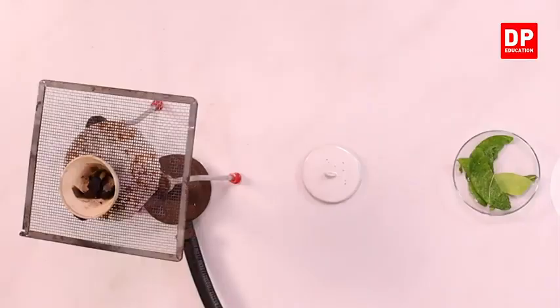Yes, you can observe nicely there is a black color residue that has been formed inside the crucible. Now that all the water has become vapor and has been removed from the sample, there is only a black color residue remaining.